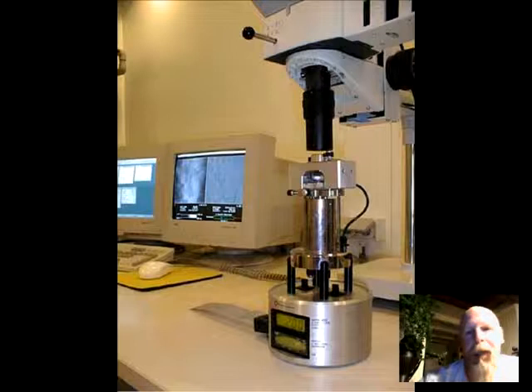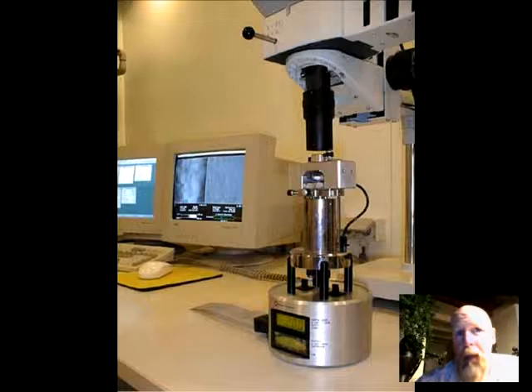I am a student at C&M, and today I'm doing a video presentation on the atomic force microscope, or broken down simply as AFM. In today's high-tech world, everyday tools and products are becoming smaller and smaller. As the reality of cost efficiency and environmental awareness grows, companies are bringing consumers useful devices in micro and nano scales. But like any macro-sized producer, these micro and nano-sized producing companies use tools to measure the output of their products, the input of their materials, and the processes in which they produce these devices.